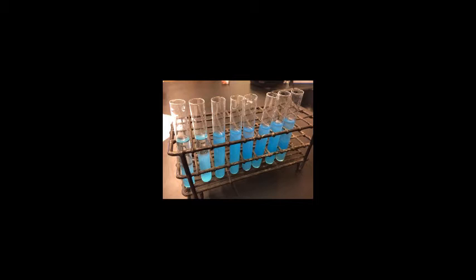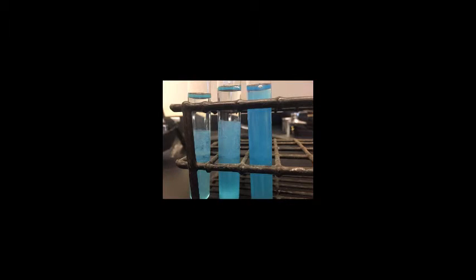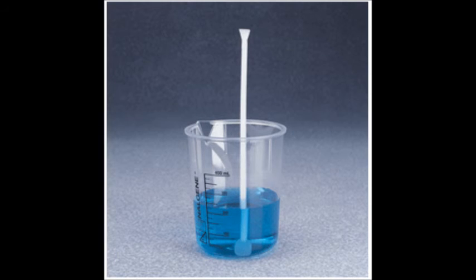A potential source of error is if we didn't add the right amount of each solution. For example, if we added 6 milliliters of KOH instead of 5, this would ruin the results because it would show that the precipitate is a different height than it actually should be. Also, if we didn't use a stirring rod to mix the solutions together, it would take the reaction longer to take place.